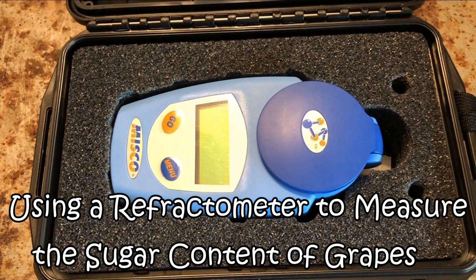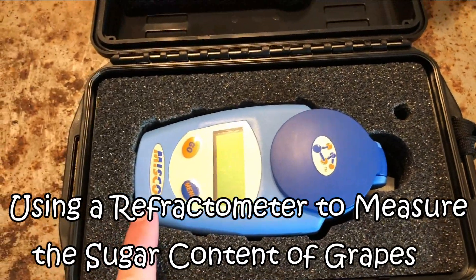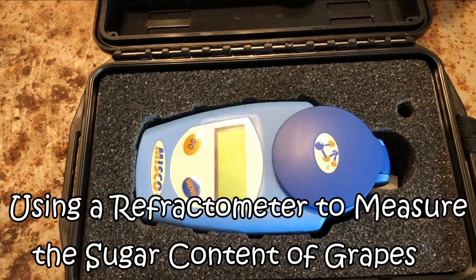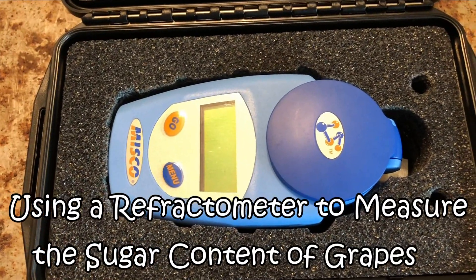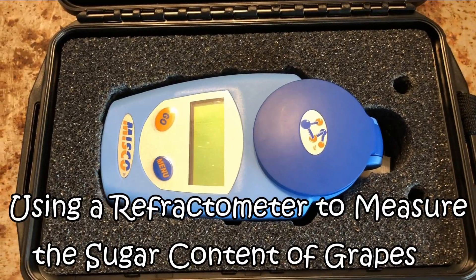Hi everyone! This is Liquid Amber Girl Gardening, and this is a refractometer. I'm going to show you how I use this to measure the brix or sugar content of my grapes. Join me!